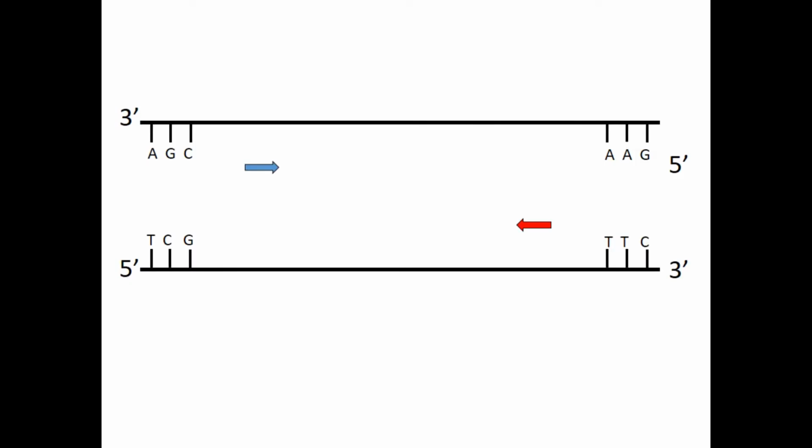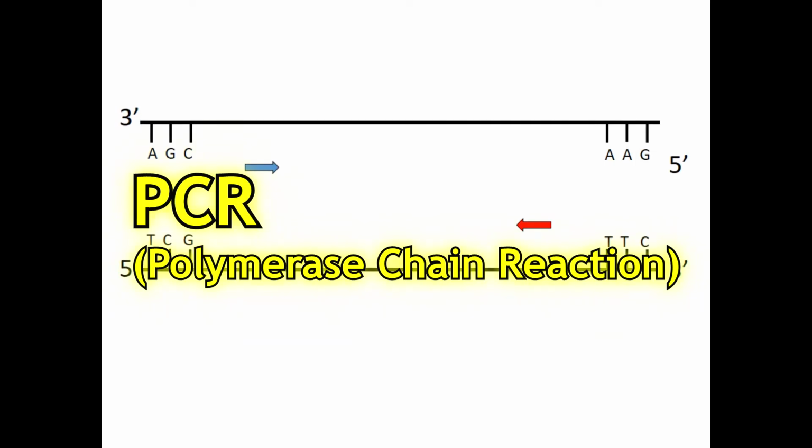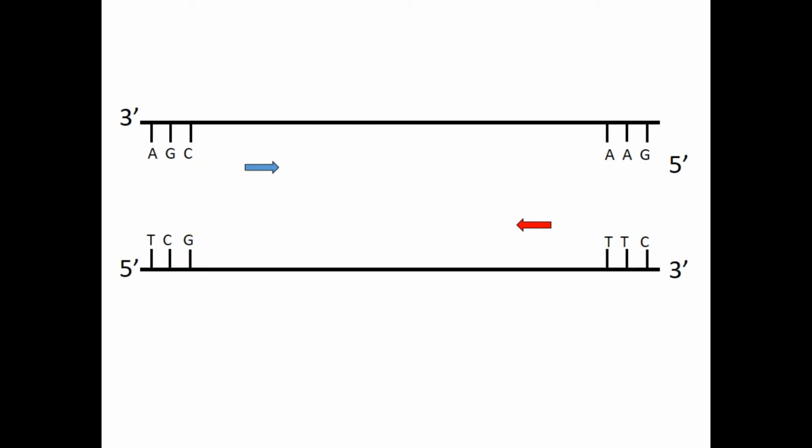Okay, about PCR, maybe you already understand what PCR is and how we can carry out PCR, what the mechanism of PCR is, but to make sure, I'll explain shortly. After extracting DNA from your samples, like microbes or fish, plants, mammals, we can get double-strand DNA from organisms.